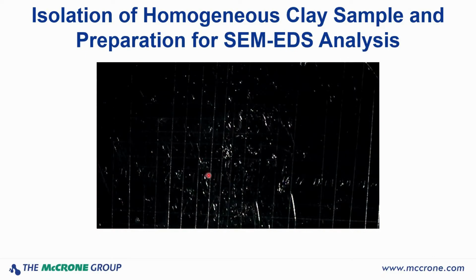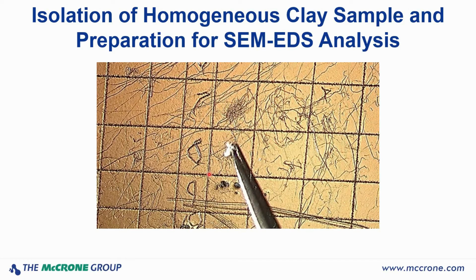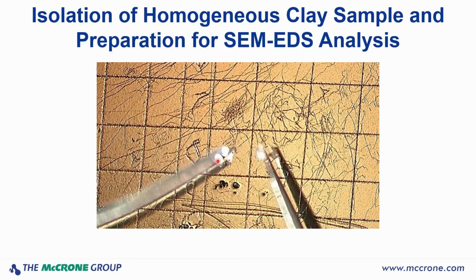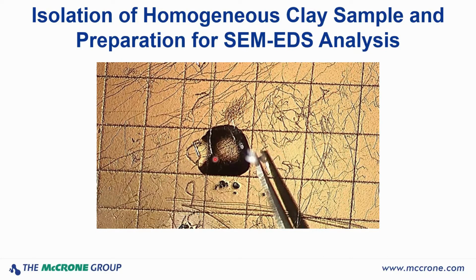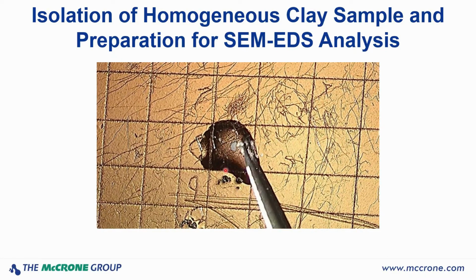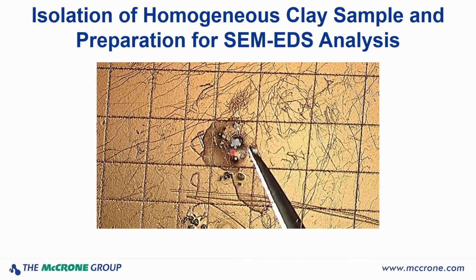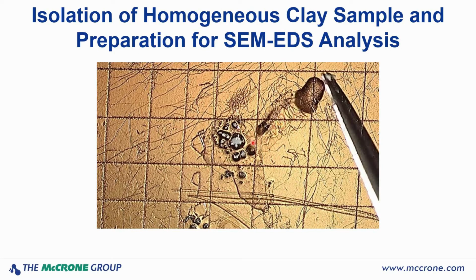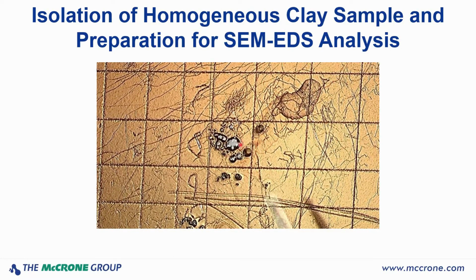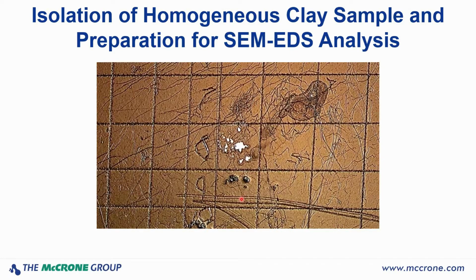We're going to move in our beryllium stub. There it is in oblique illumination. Now we put it in coaxial illumination. We can see a lot better what we're doing. We add our micro droplet of amyl acetate. We put on our sample, and now we're going to pull some of that amyl acetate off because that's going to take with it a lot of the excess adhesive, so that when we analyze this, we don't have carbon and oxygen showing up quite as much from the adhesive.